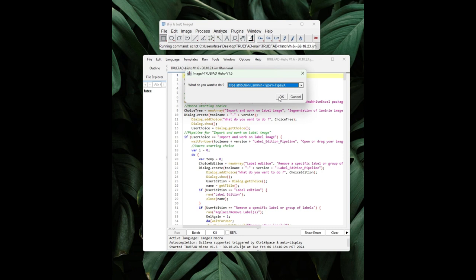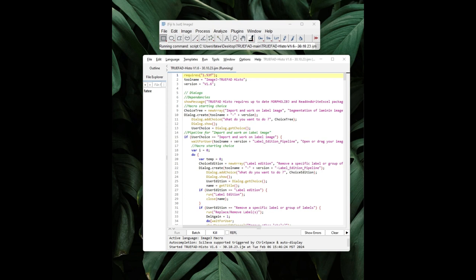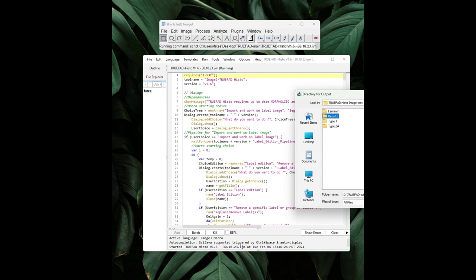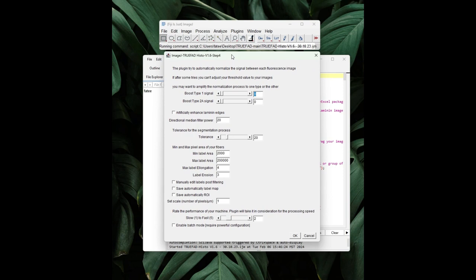You will be prompted to select the path for the folders corresponding to each labeling — laminin, type 1, type 2a — in the specific order. From there, you will also need to add your result folder. Then it is possible to adjust the probability threshold to assign fibers to type 1 or type 2a. However, we recommend keeping the default parameter unless adjustments are necessary based on the quality of your image acquisition. It may help to manually check a few images from a batch using a different threshold before running through the full batch. On the second settings page, you can see various parameters that can be adjusted to modify the resulting segmentation, fiber retention, and result export.